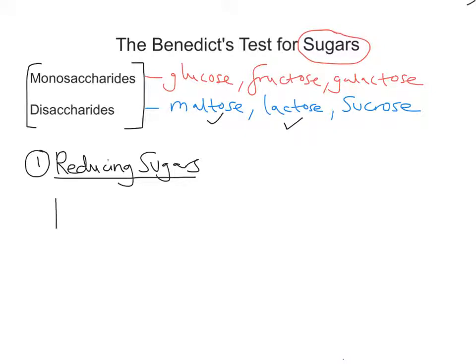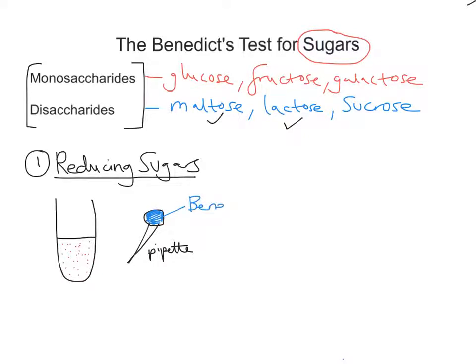To test for reducing sugars, we take a sample in a test tube and add Benedict's reagent, which is blue, using a pipette. It's always good practice to use an excess of Benedict's, because that ensures all of the sugar will react in the process. So we've got our unknown solution and we add Benedict's reagent to it.